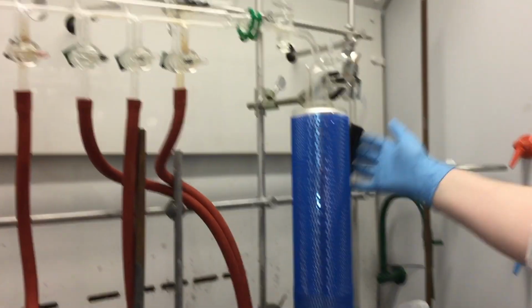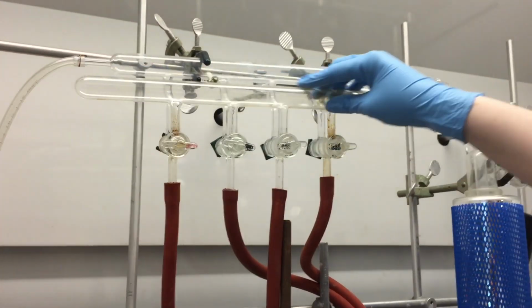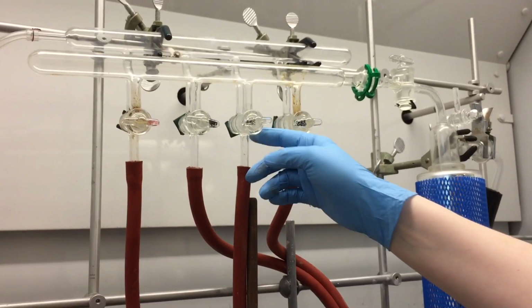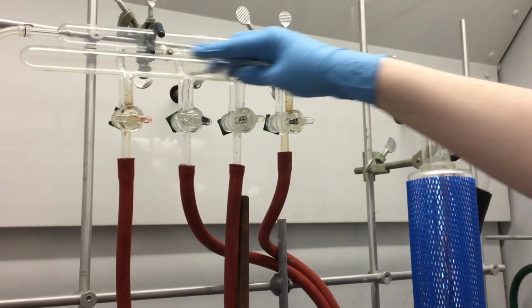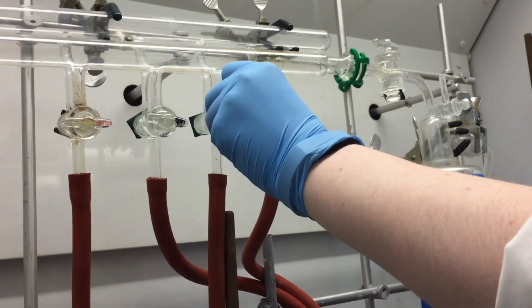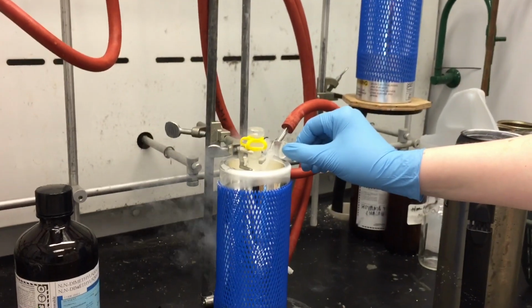On your Schlenk line, you'll see that the vacuum goes into the muck trap, then goes into the main line. So you know that it is this part here that's under vacuum. When you open up your tap, you want to make sure that you're lining up the tap with the front in order to get vacuum to your line. So for me, that is this way. You can hear it gurgle a bit. And then we are going to open it up to the solvent.